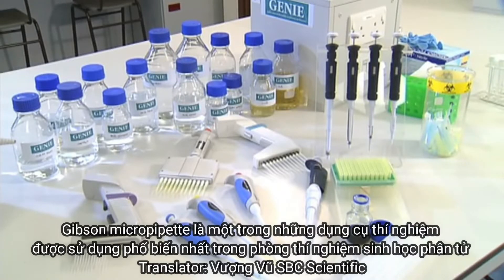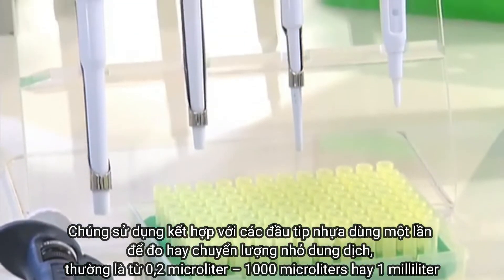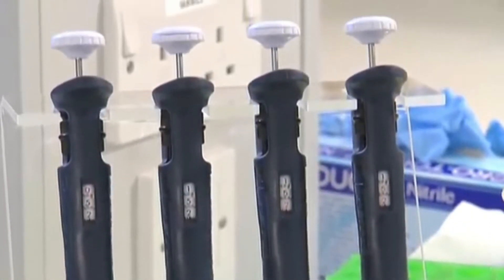Gilson or Finnpipette micropipettes are one of the most commonly used instruments in a molecular biology laboratory. They're used in conjunction with plastic disposable pipette tips to measure or transfer small amounts of liquids, usually from 0.2 microlitres to 1,000 microlitres or 1 millilitre.